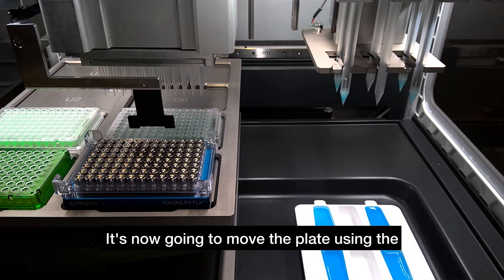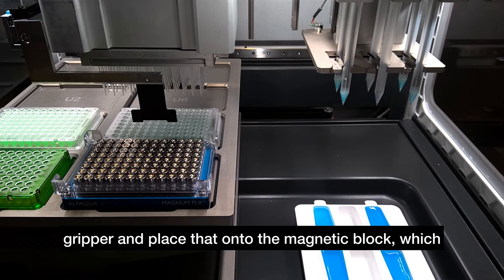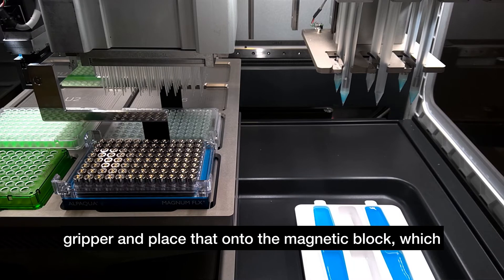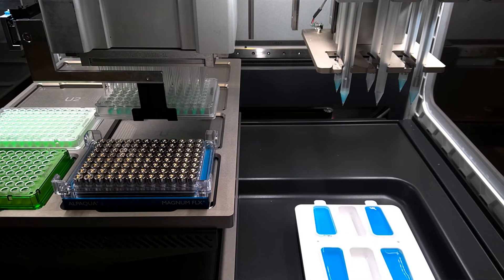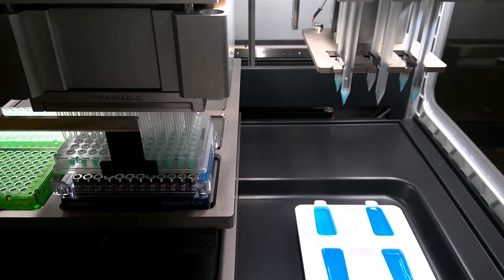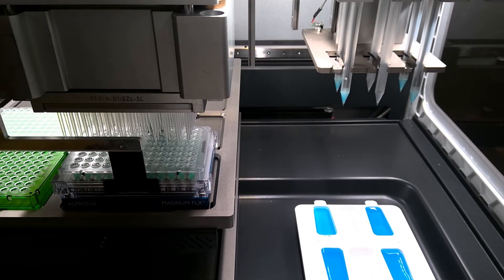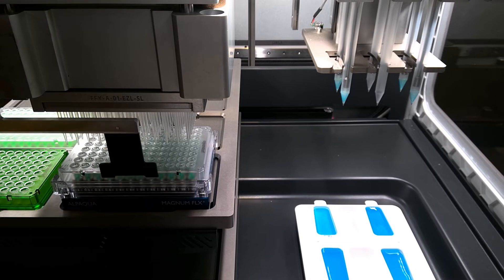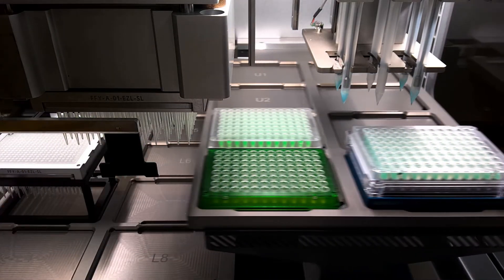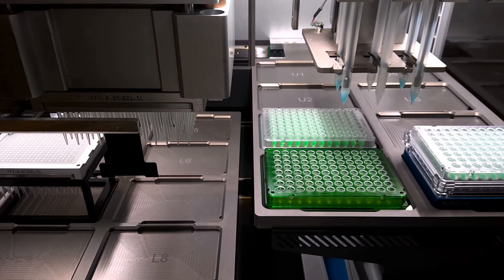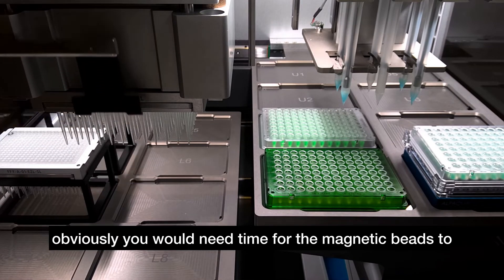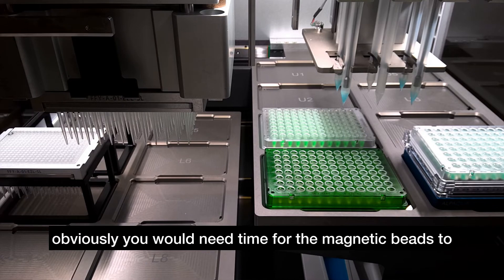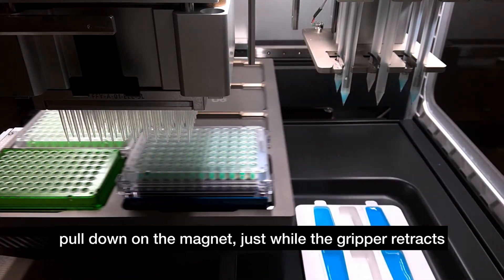It's now going to move the plate using the gripper and place that onto the magnetic block, which in this case is the Alpaqua Magnum FLX block. So it's just going to move that across. It's just given a little time here just for the magnetic beads to pull down on the magnet, just while the gripper retracts.